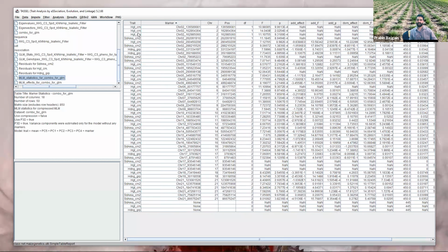If you look at height here, let's look at these two loci. They are both 162 megabases apart, only, well, at 162 megabase, yes. But if you look few kilobases apart, now, are they the same QTL? Are they different QTL? Well, depending on how much you know about your species, you can declare that they are the same, but an easier way would be to use other programs to declare if they are in the same haplotype block.